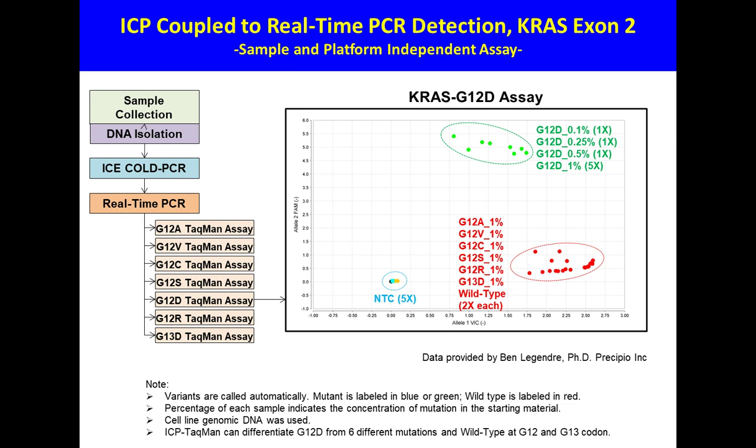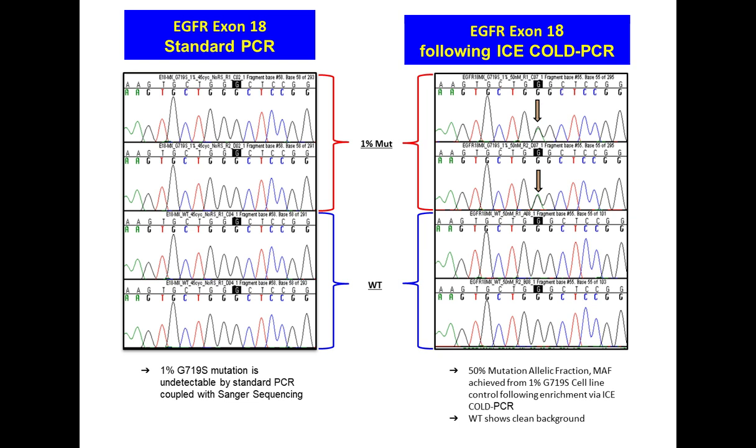That will tell you exactly which mutation you have. So you have a series of reactions, each one interrogating one particular mutation, and that is a very reliable application.